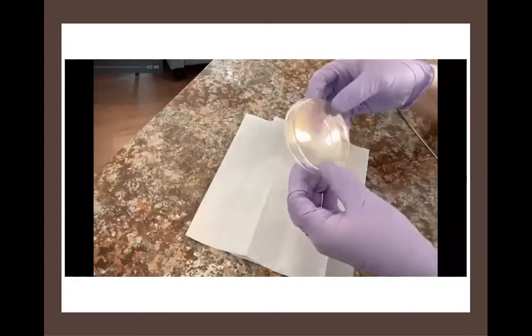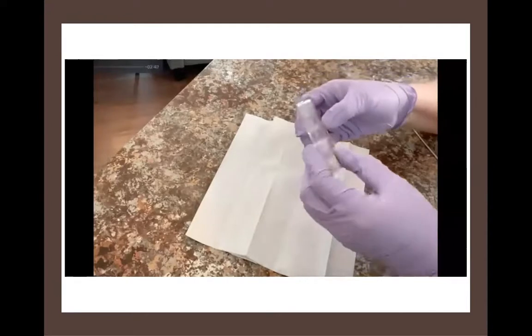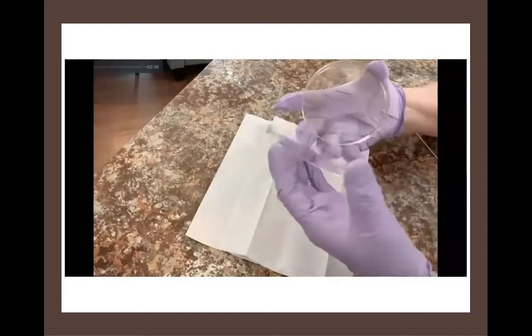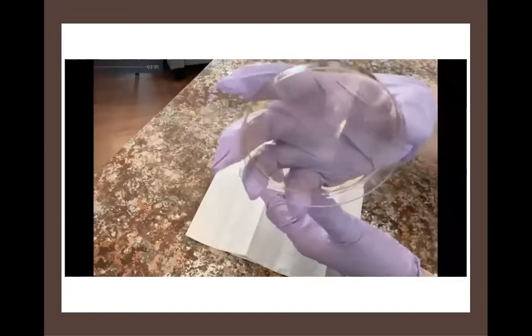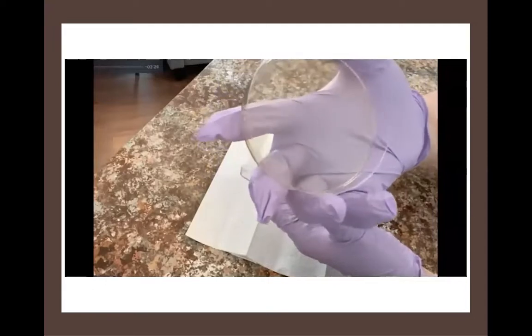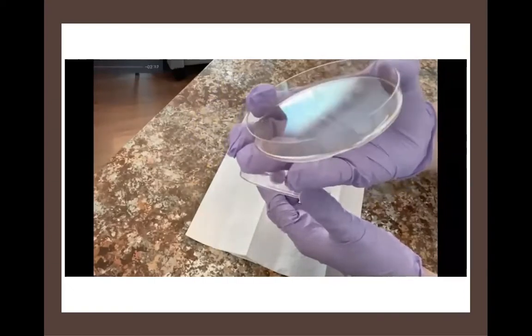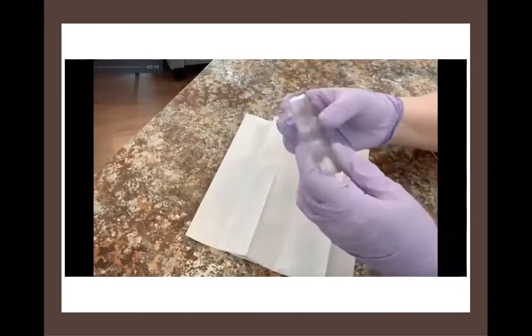So this is an agar plate. This happens to have nutrient agar on it. You can just see it. It's a thin sort of beige film on the bottom of the plate. Now I'm taking the lid off just so you can see the inside of the plate. There's just this beigeish sort of sheen to that media. Very, very thin layer of media in here. It feels a lot like gelatin. And it's easy to push your loop into that gelatin. So you have to be careful when you're handling it.